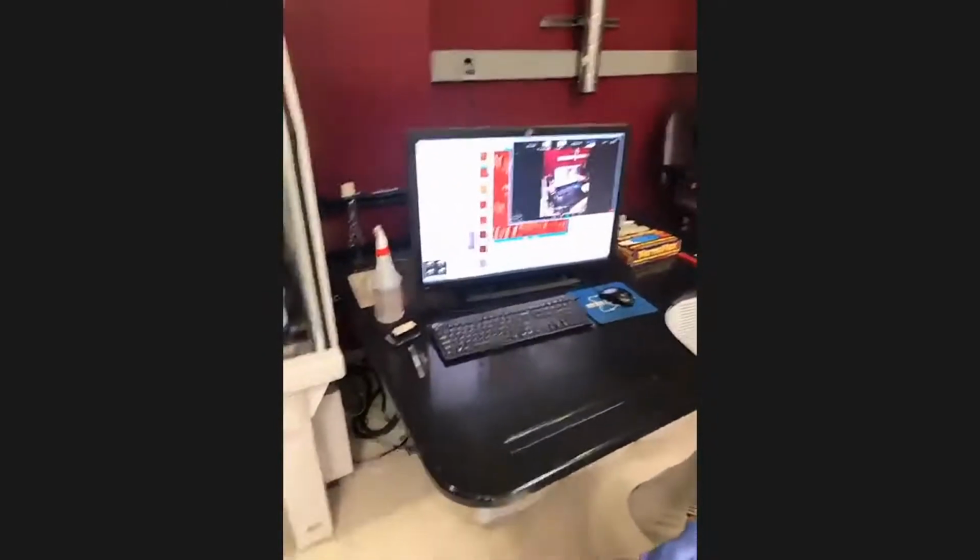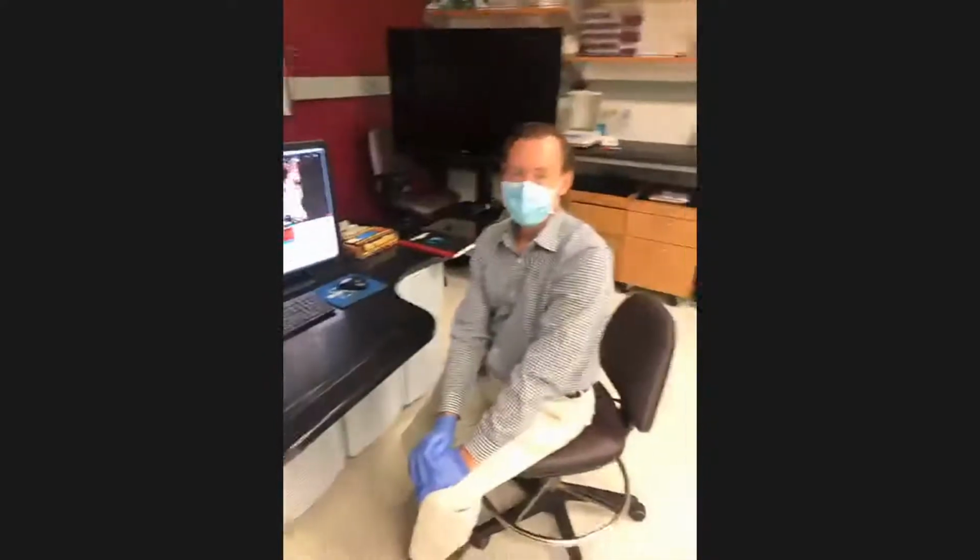And Peng is going to talk briefly about how we handle all of the data that comes out of these microscopes. To give you a sense of what I'm talking about, one of those electron microscopy reconstructions that you saw generally takes a few 100,000 individual images. That light sheet microscope I showed you before can collect tens to hundreds of thousands of frames per second. So you've got an immense amount of data and a pipeline of data that needs to be processed, stored, manipulated in real time in many cases, or even after the fact, that we have to be able to handle.